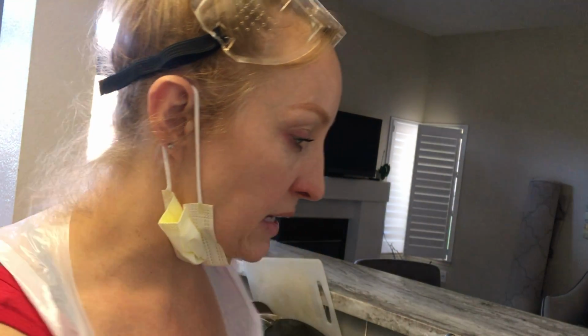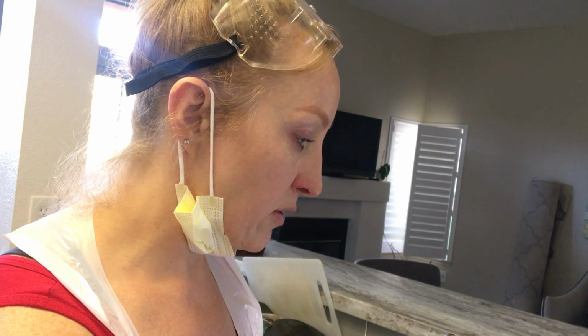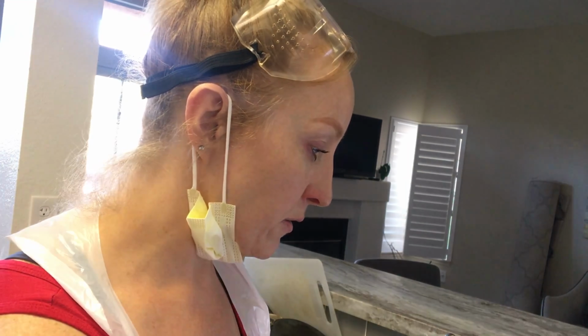And although the gram-positive has the safranin too, the violet color is just so much darker and it just hides the safranin color. And so the cell wall is just so thin that the violet just washes out, and that's why the gram-negative ends up pink, and then we can tell the differences. And so I'm going to show you another example here.